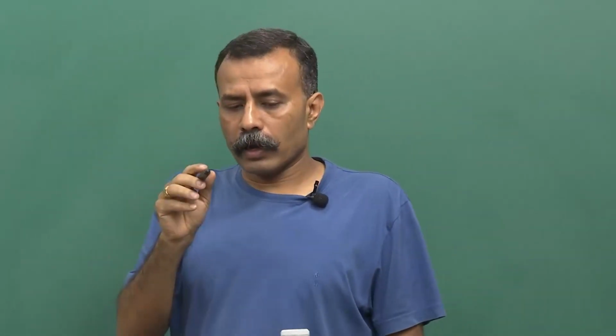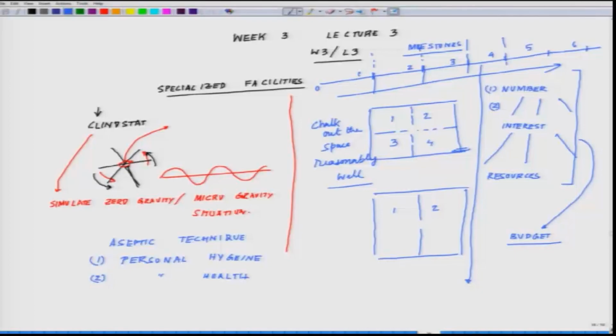So say for example, you have one incubator here, right? And of course, for that one incubator, you have a cylinder adjacent to it. So you have another incubator stacked on top of it. You have, say, 2 cylinders hooked up here, like this. I'll recommend you have 2 more standby behind them for the rainy days, because your friends will forget that these are about to end, and then you are hovering, running around, what to do. Don't allow that to happen. So have these backups ready.